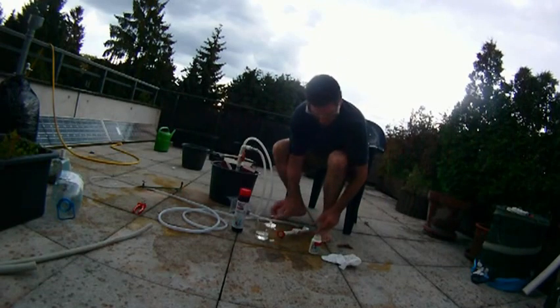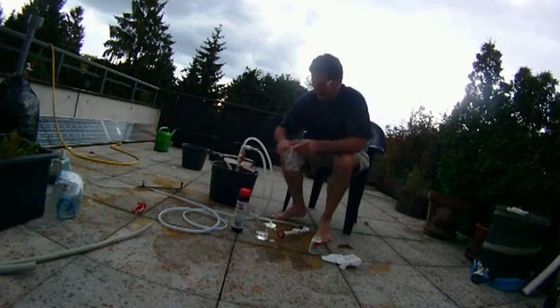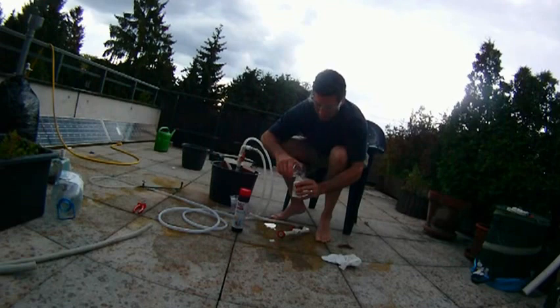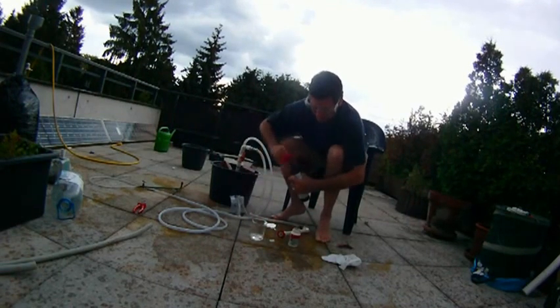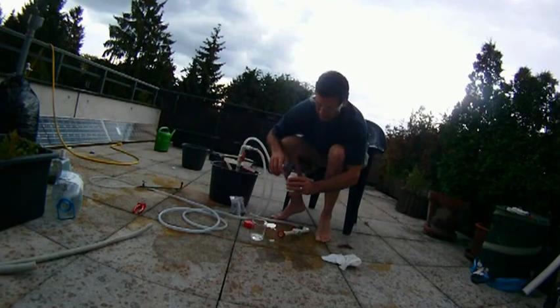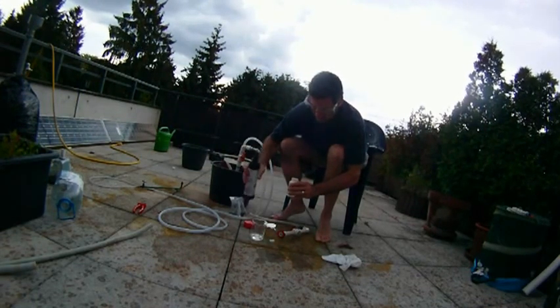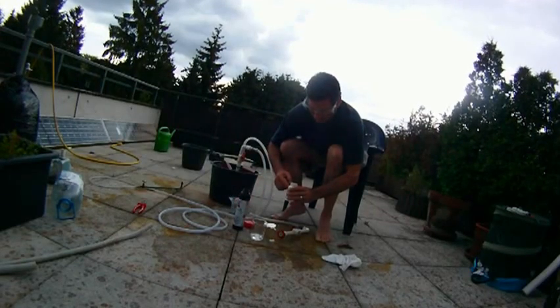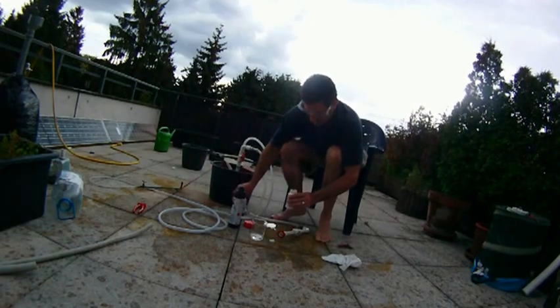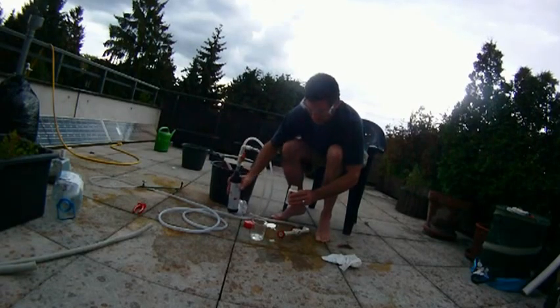I take a couple of these tabs — three or four of them — and drop them into the bottle. I pour in some water, not too much, just enough to cover them. Then I take these sodium hydroxide crystals and pour them in, until it begins to bubble. I'll throw another tab in and a little bit more sodium hydroxide to increase the concentration.